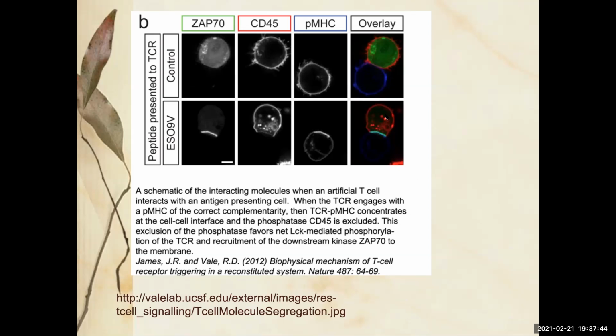So, exciting finding. How did they do it? They did it with fluorescent microscopy by labeling everything with different colors. How did they actually image it? They took images one color at a time. So that's what is known as one channel.